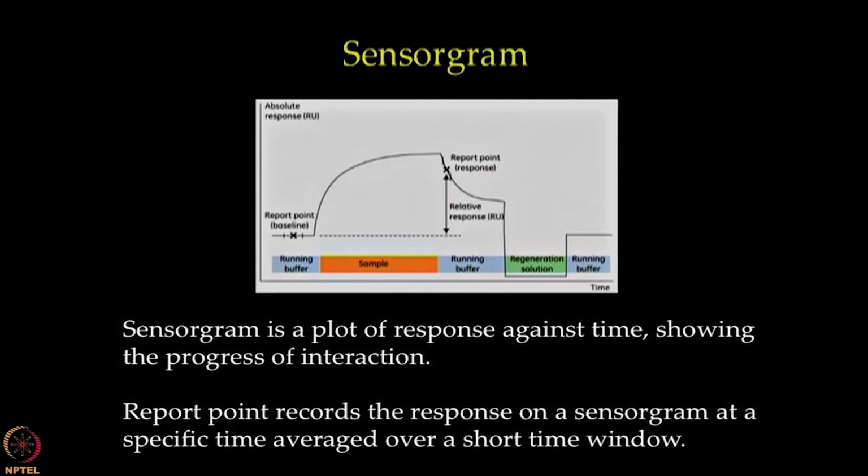We will now proceed to analyze the data obtained from binding of anti-beta 2 microglobulin with beta 2 microglobulin protein.